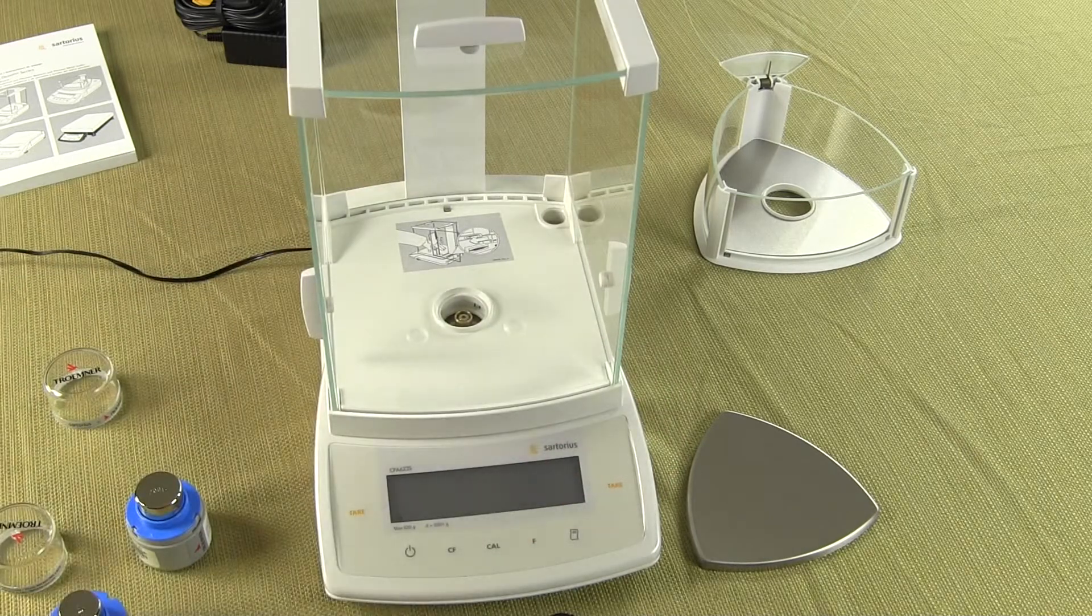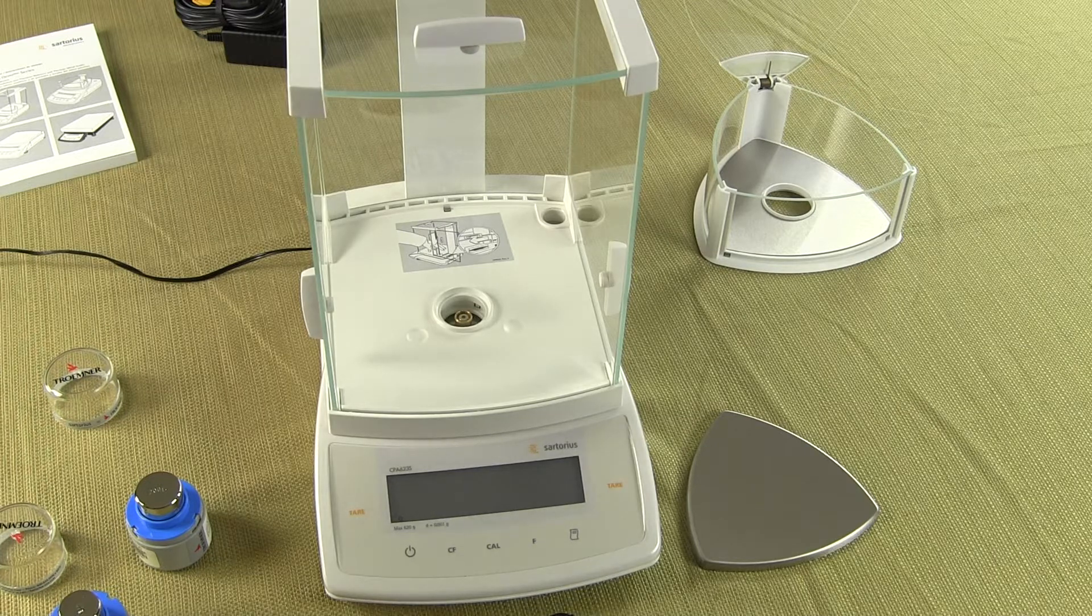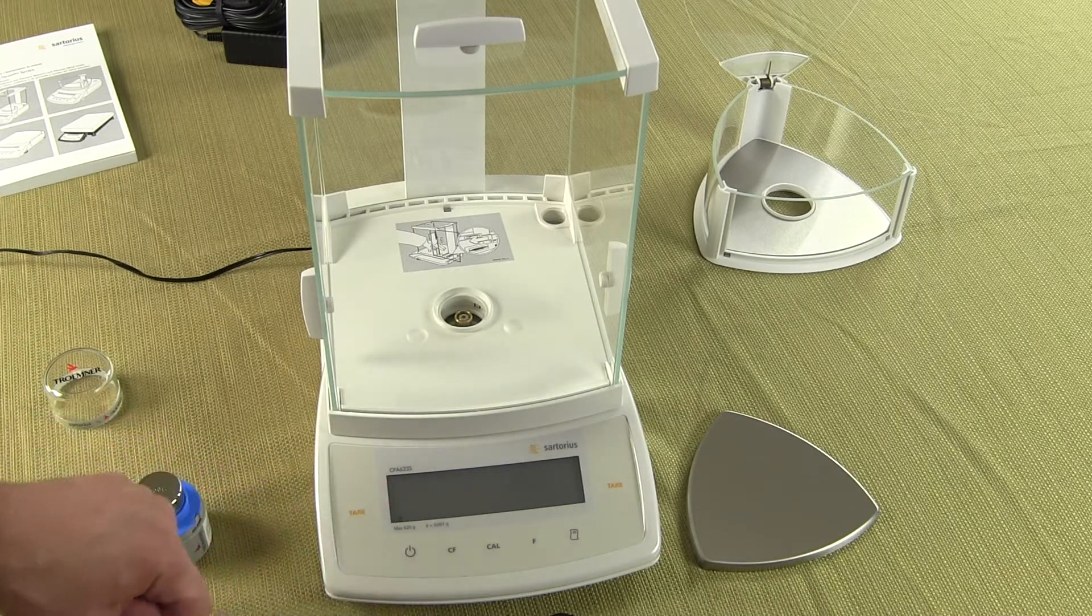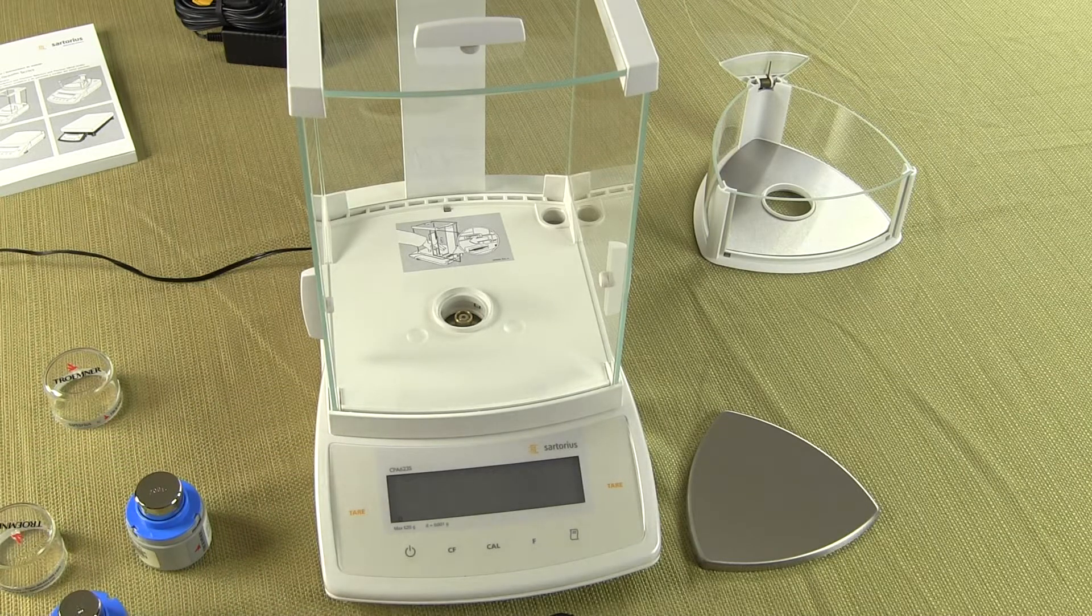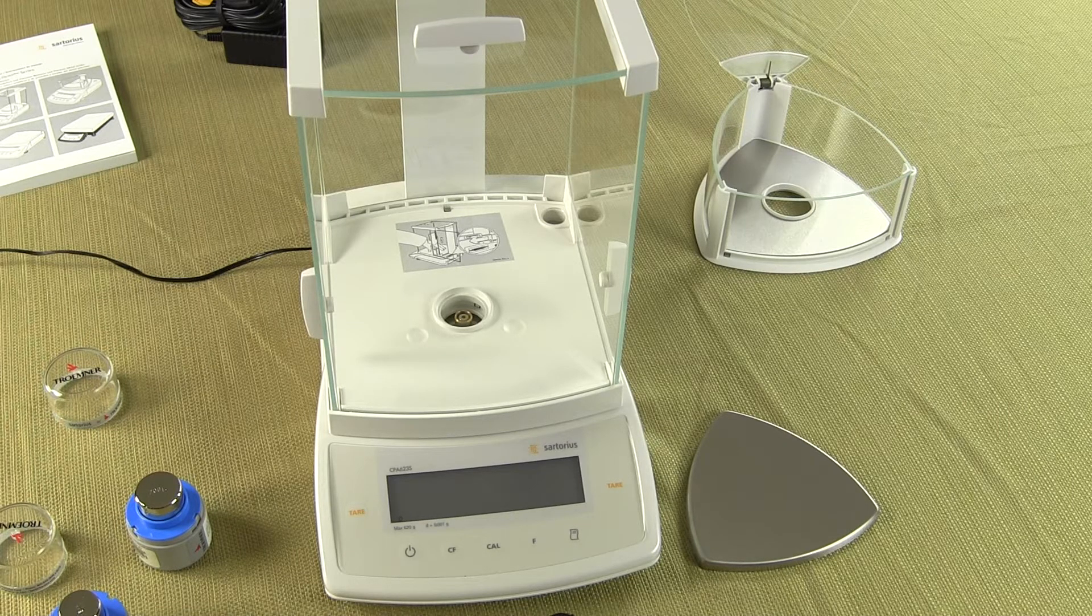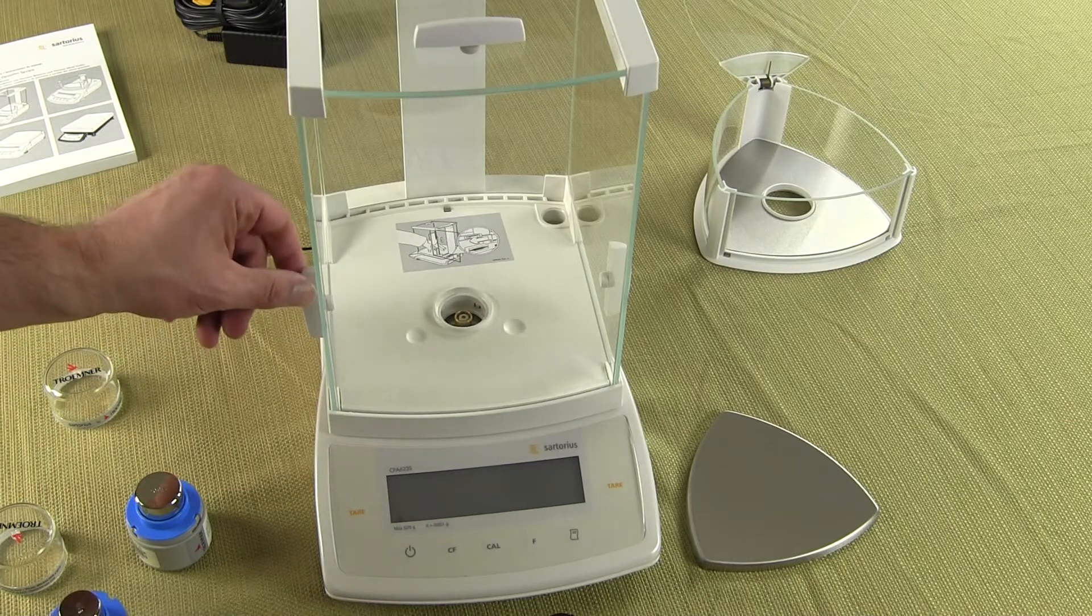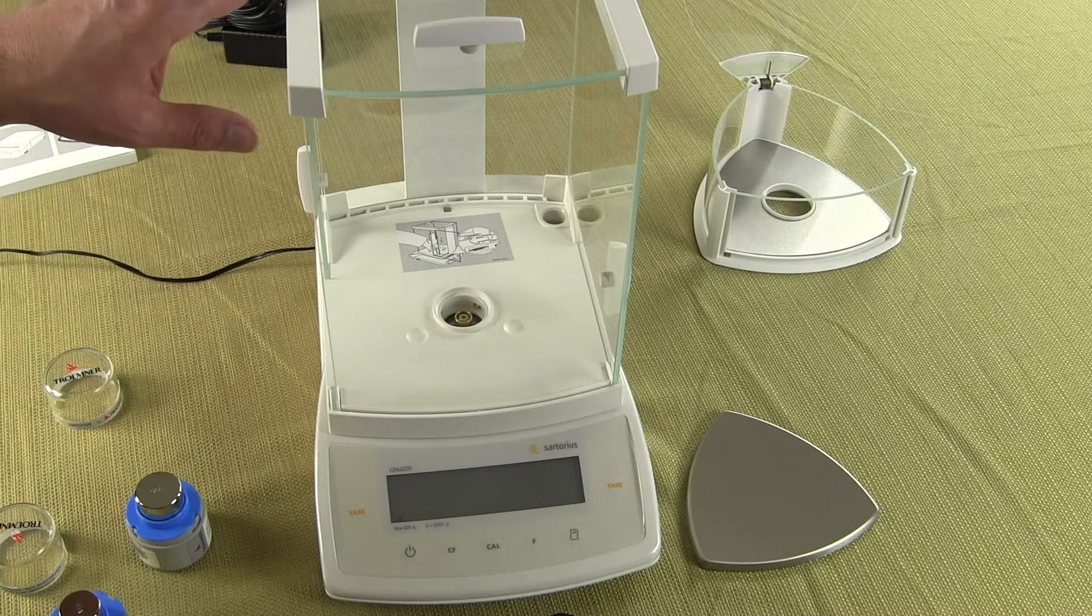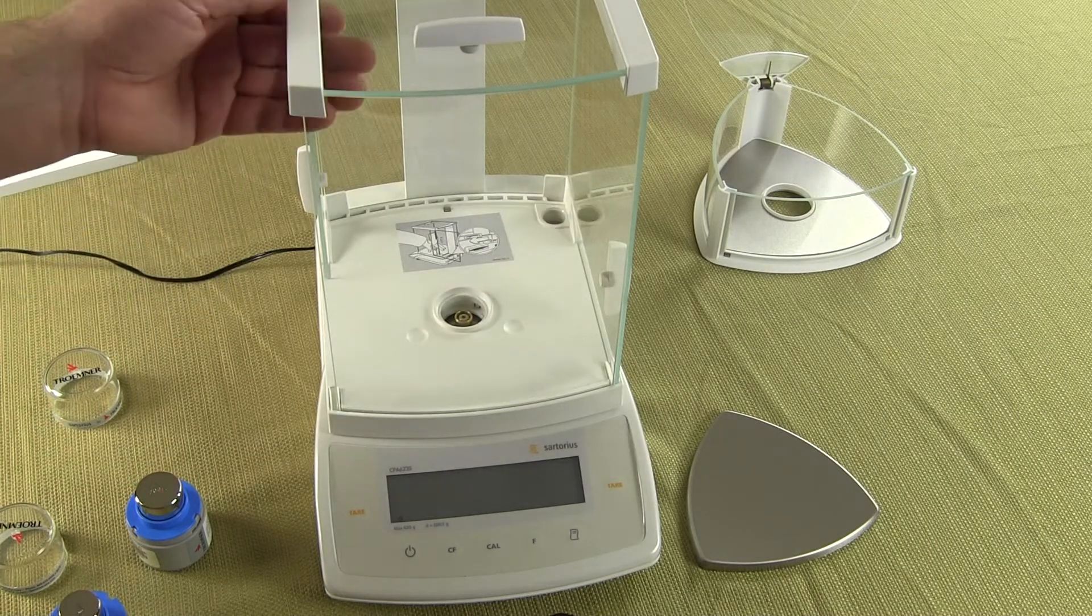A couple other quick things about the balance, the CPA series comes in a half a dozen models. This is the CPA 623s, you also have a 223s, 323s, 423, then there's a 1003s and a 1003p poly range. Now the 1000 gram units actually come standard with the square draft shield, so this is the optional square draft shield if you're buying anything basically 600 grams or under.